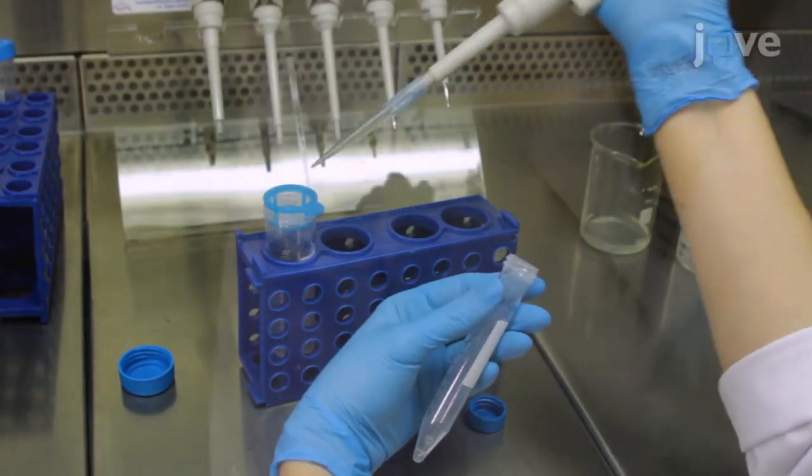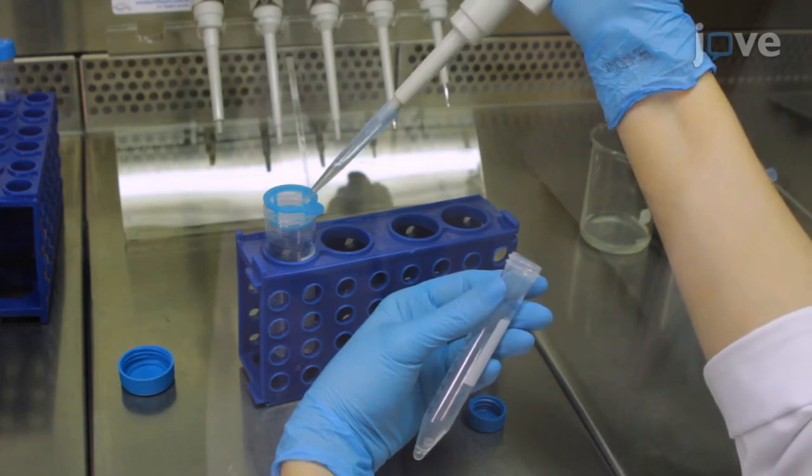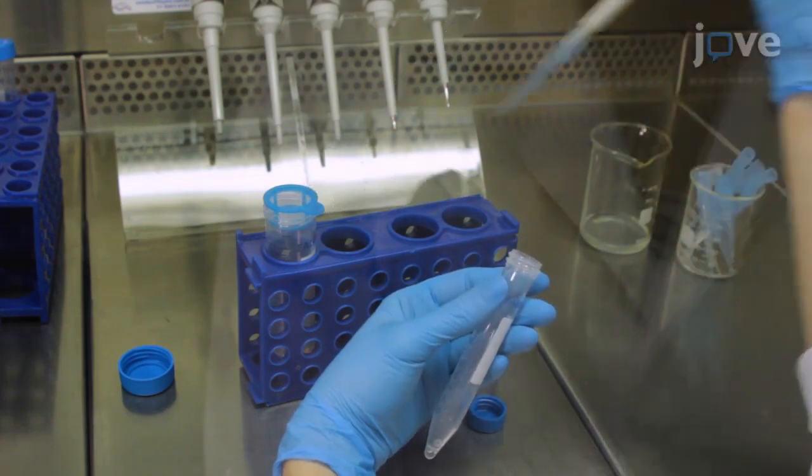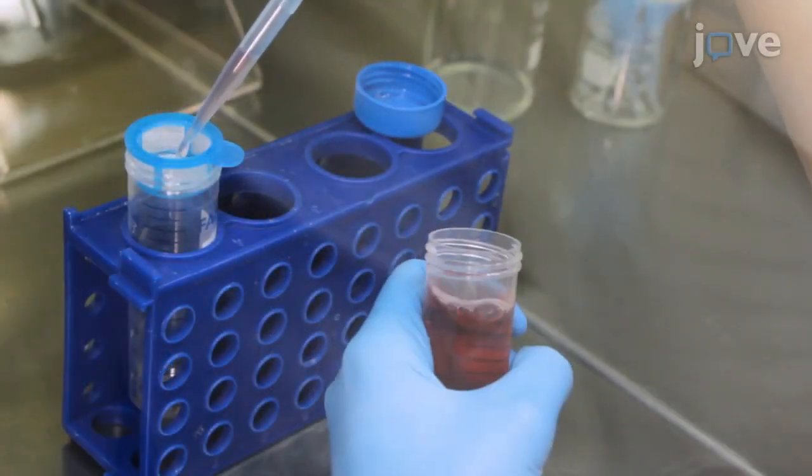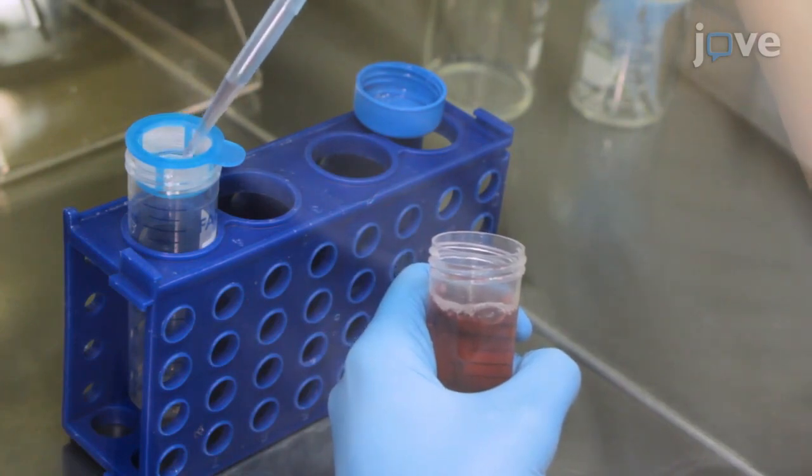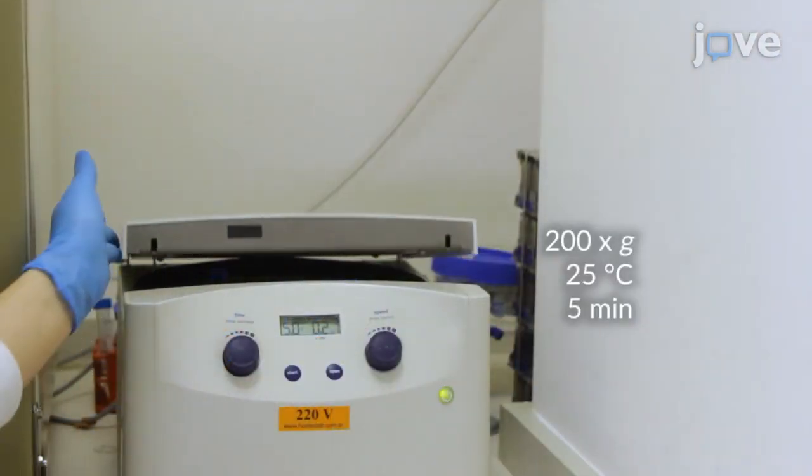Filter the suspension through a 40-micrometer cell strainer filter to remove non-dissociated fragments. Wash the filter with 1 ml of astrocyte medium and pellet down the filtered cell suspension by centrifugation.